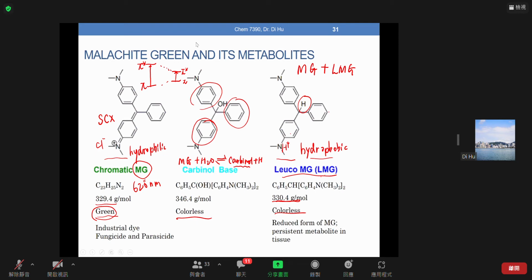That's okay, we'll talk about it later. Think about it: because of the structure, we consider the sample cleanup method we can use. And also because of the structure, we think about what the pH should be when you load the sample, and what the pH should be when you elute the sample, okay?